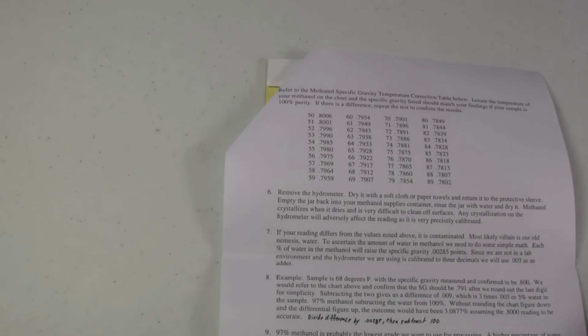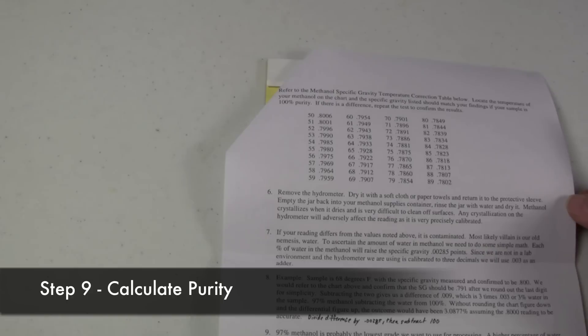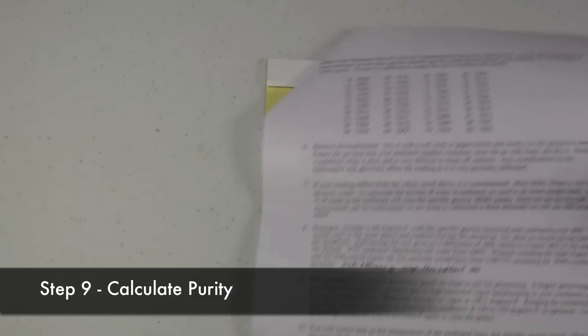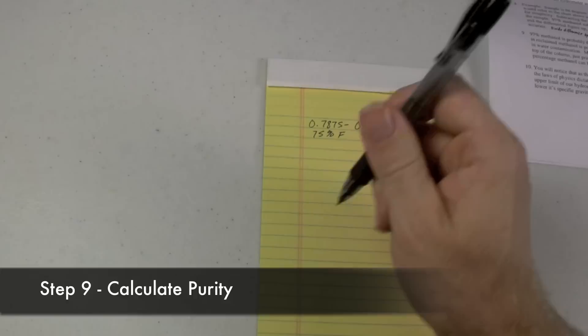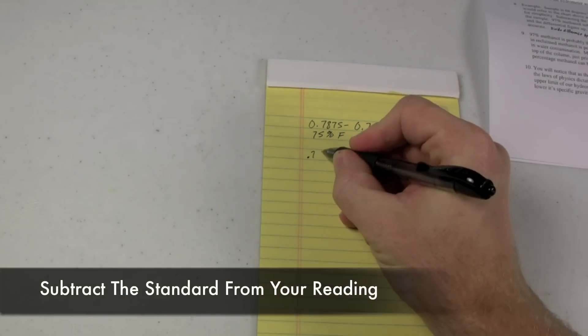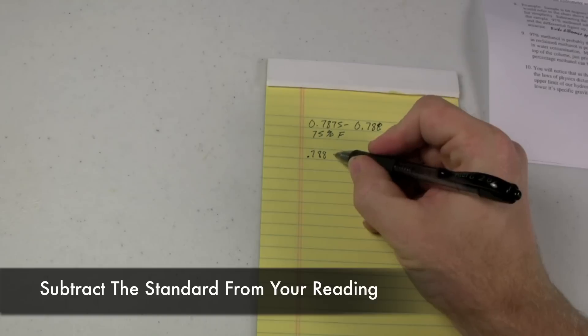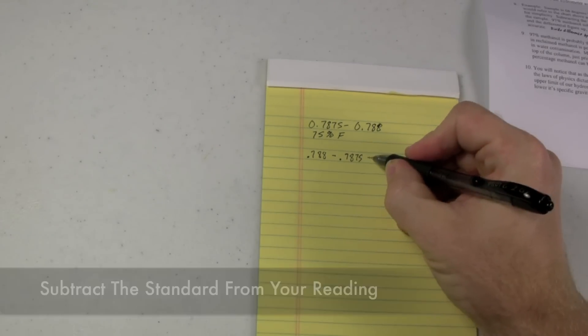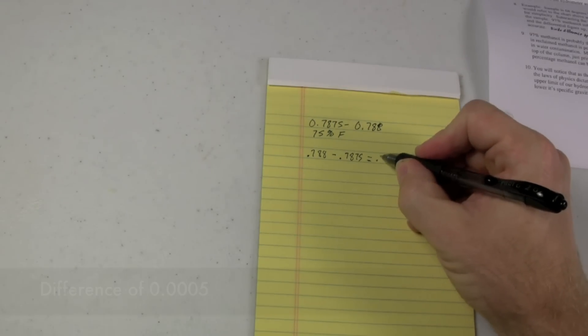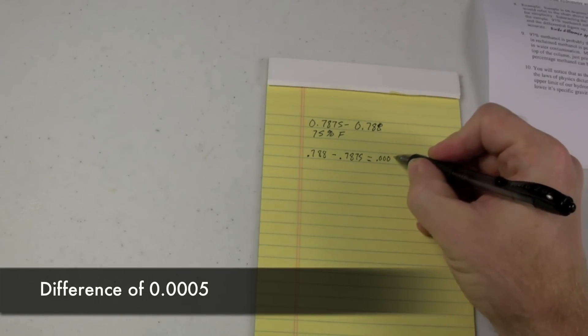For the calculation purposes, let's go ahead and say that it's .788. So the way that you calculate your methanol is you would take the reading that you got, .788, and you subtract from it what it should be, .7875. That equals .0005.